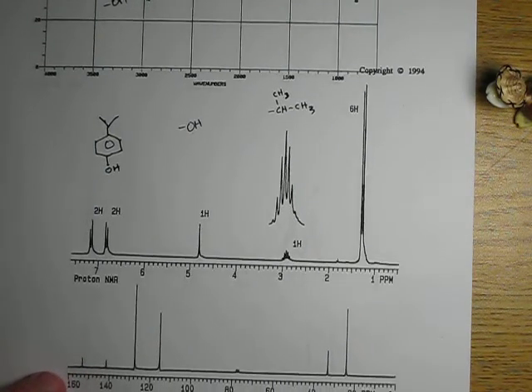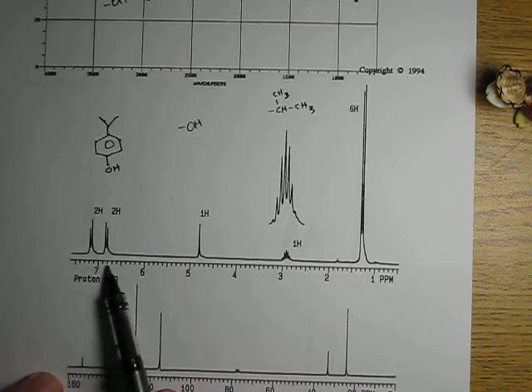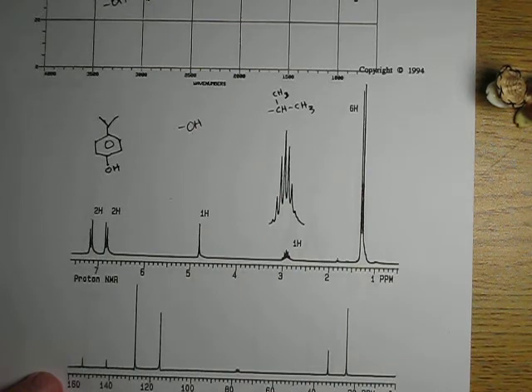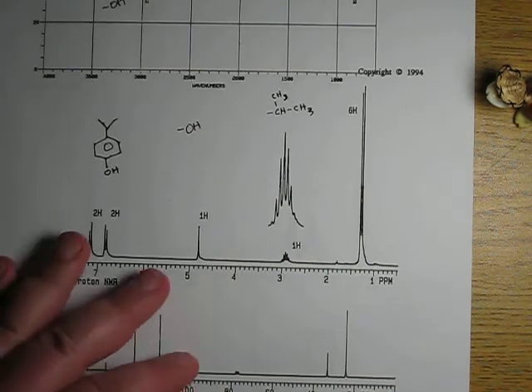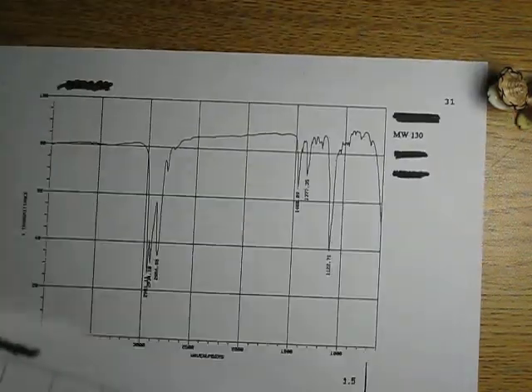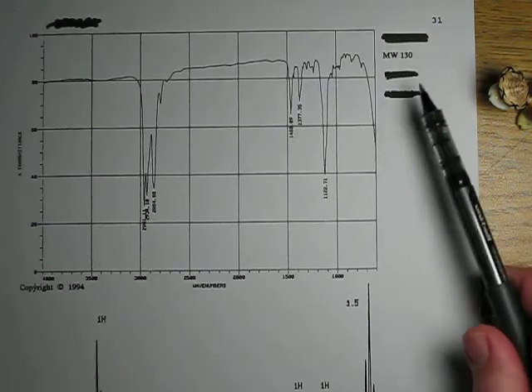That's my molecule. It works with the spectra, it works with the mass, and not only that, I've got its oxygen bonded to the benzene ring, which I figured was going to happen because I've got a resonance upfield of 7 ppm. All right, one more to go. Let's see what this last one looks like. All right, molar mass is 130.